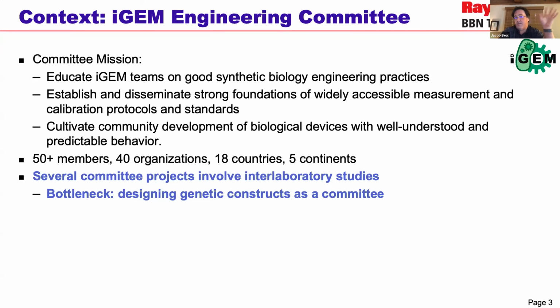Nobody should ever use arbitrary units or relative units again. You should always turn your data into equivalent molecules per cell, because then you can relate it to the biology. Sure, exactly, yeah.